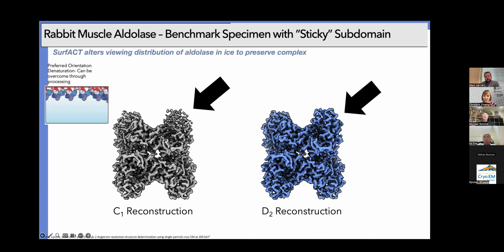Is there a standard preferred orientation workflow you'd recommend on CryoSPARC after 2D classes? So again, it's image processing rather than sample prep. Exactly. And I think the problem is it's so subjective.